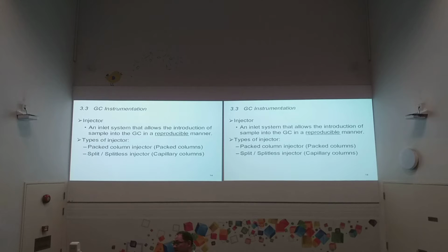We do understand in reality there are many products, many chemicals, that are not that easy to vaporize, right? Some chemicals have a very high boiling point. So that's why in the first place, this technique, in principle, is not the best technique, it's not suitable. So all this we need to bear in mind.